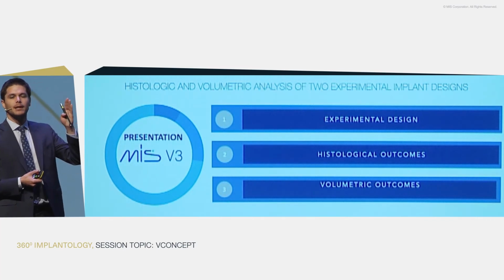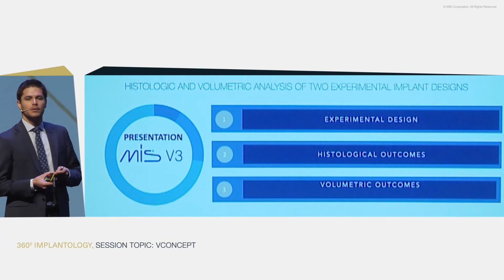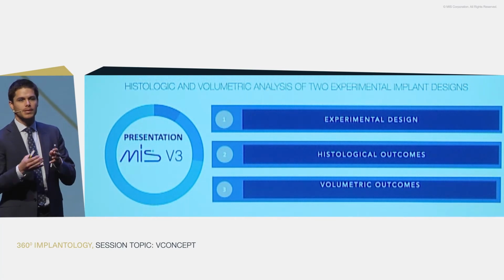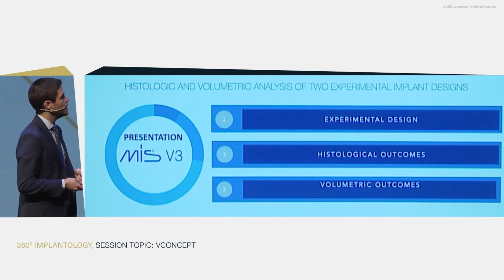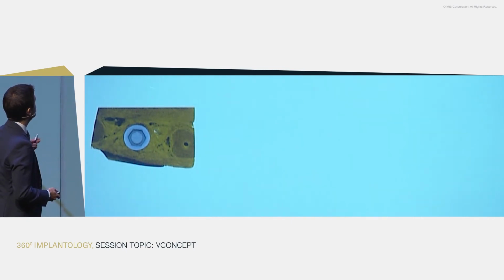We're only looking at the real center of the implant. We're looking at sections that have 30 to 40 microns of width. So if we could have the opportunity to look at a wider area of the implant, we perhaps could assess as well what is the bone volume and what are the impacts on the soft tissue of these different implant designs.